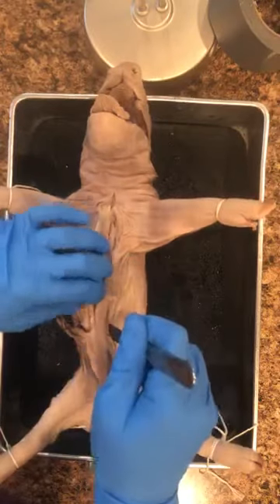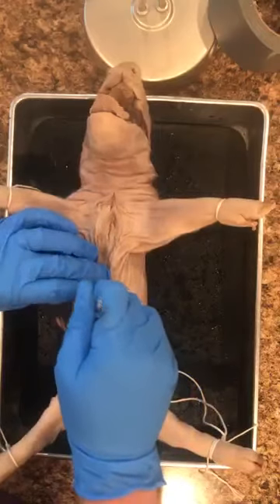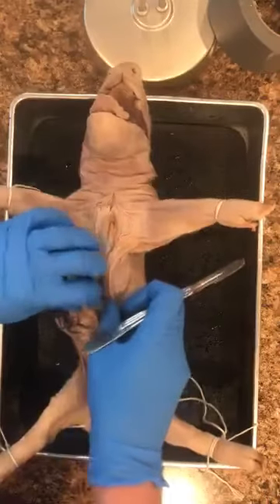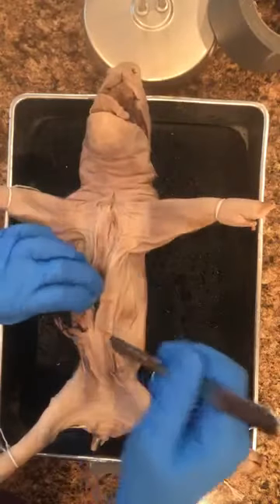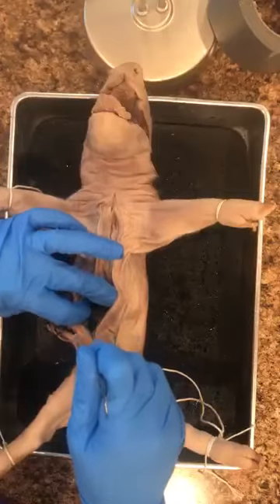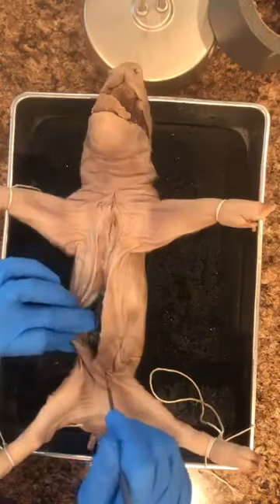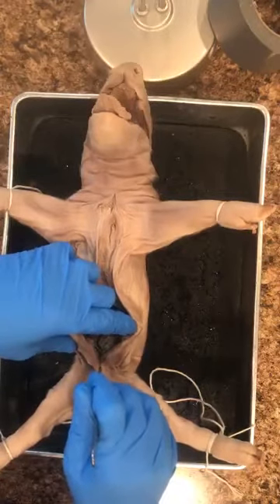Okay, and we are into the abdominal cavity there. So I'm into it. This is just mesentery, which is that thin tissue that covers everything and protects it. Oh, guys, this is so cool. I love seeing this stuff.